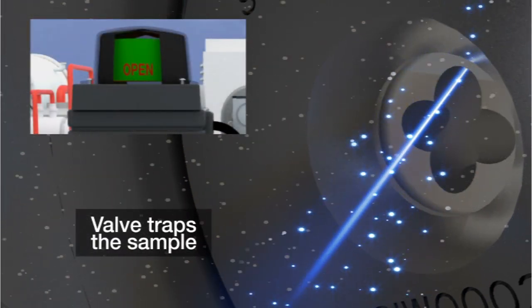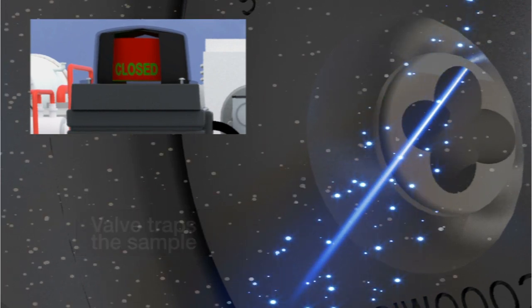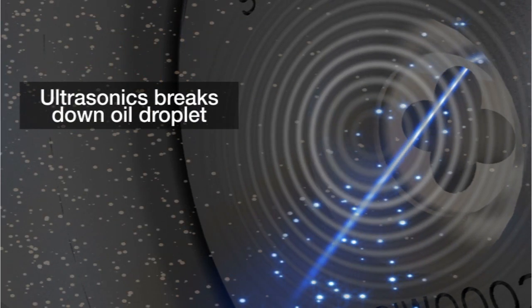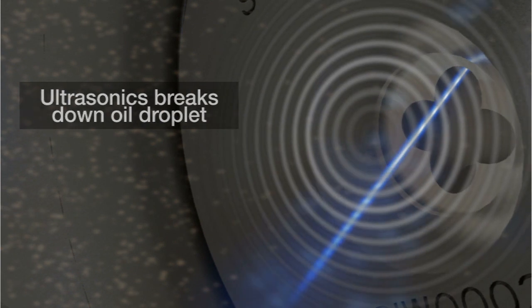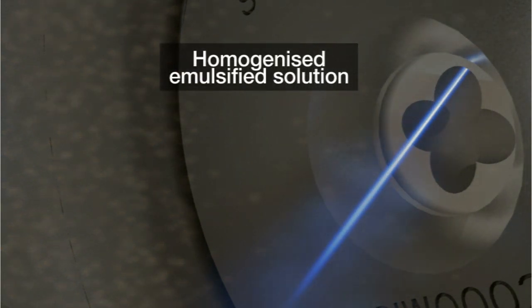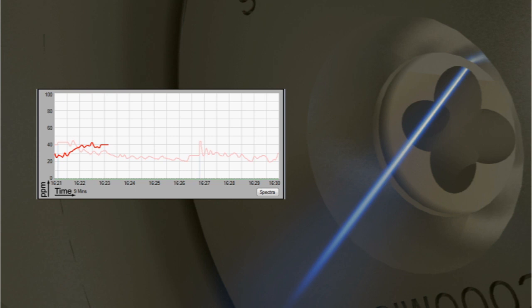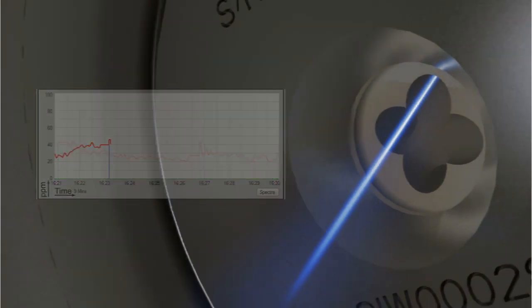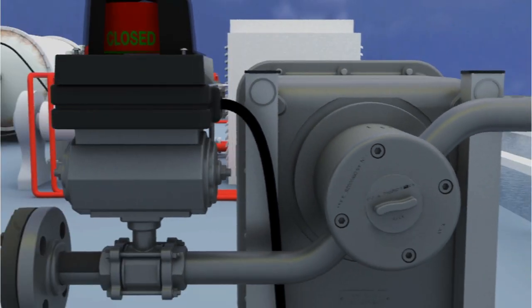Once the sensor has been cleaned, the valve traps a sample in the sample chamber, and using the ultrasonics, breaks down the oil droplets and leaves a homogenized emulsified solution. The PPM is then measured again, and this value can be used to compensate the real-time readings should oil droplet size be an issue.